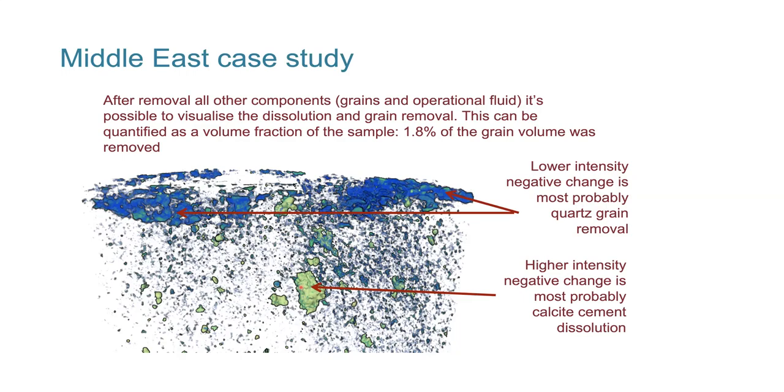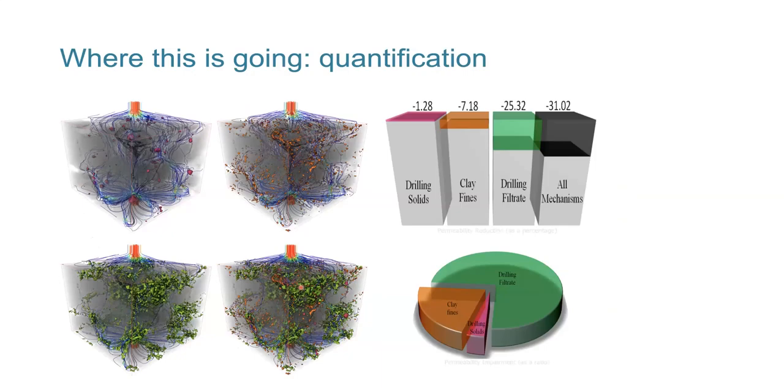The last slide I'm going to show you before we stop for questions is just to show you where this is going. So I showed you these kind of qualitative techniques, and I said I was going to show you where the state of the art is in the industry. This is something that we've received a patent for recently, which is looking at combining multiple scales of resolution of analysis using micro CT and nano CT and electron microscopy and specialist electron microscopes called focused ion beam, and combining all that in a simulation and using algorithms to basically individually segregate damaging mechanisms.